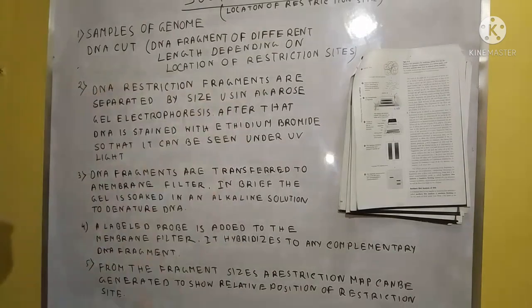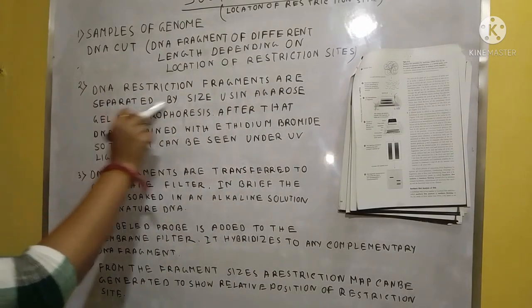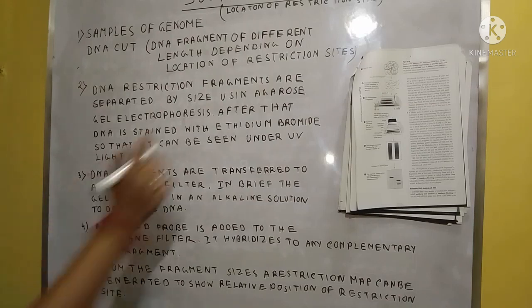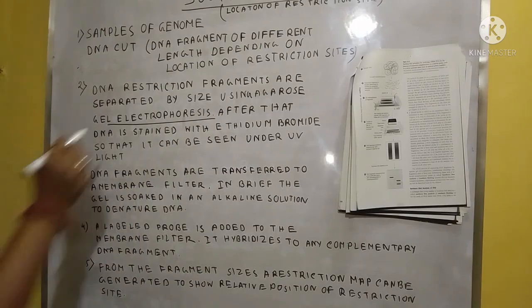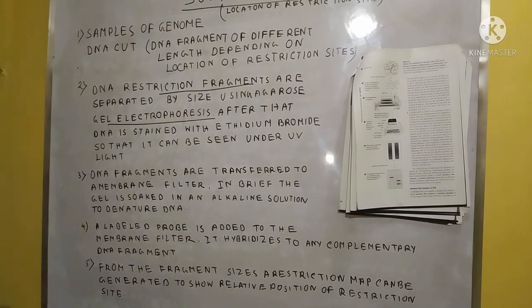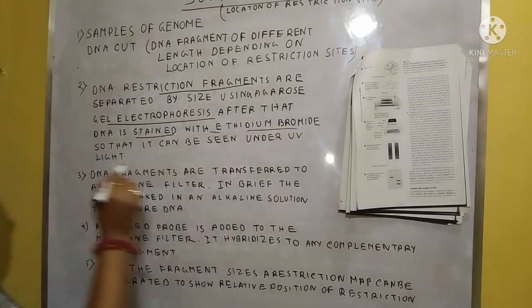After cutting into fragments, the DNA restriction fragments are separated by size using agarose gel electrophoresis. This is the process, gel electrophoresis, where we separate the DNA restriction fragments. After that, the DNA is stained with ethidium bromide.